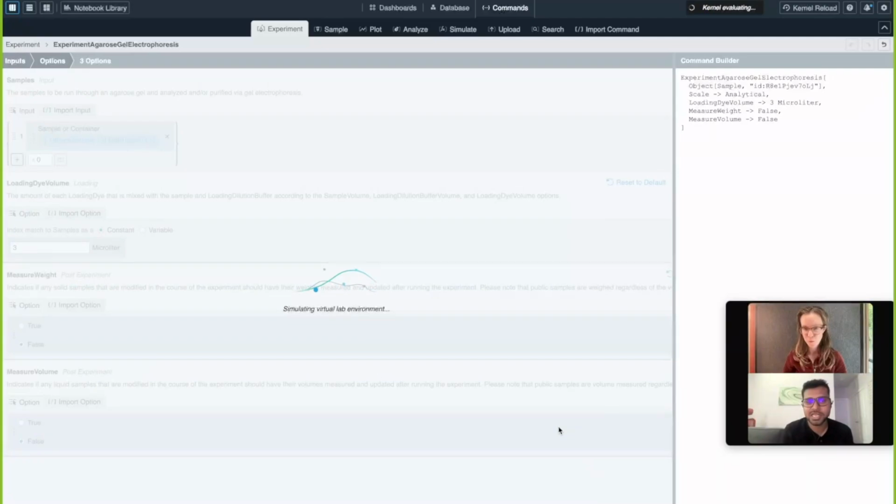As you can see, this can be a slightly tedious process to build a command from scratch. If you've written these before, you kind of know what settings you want, and you can just jump right in, and there's nothing stopping you from just typing in the code directly.